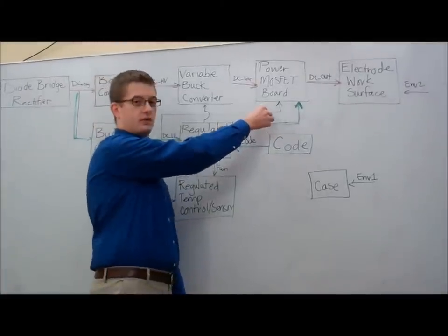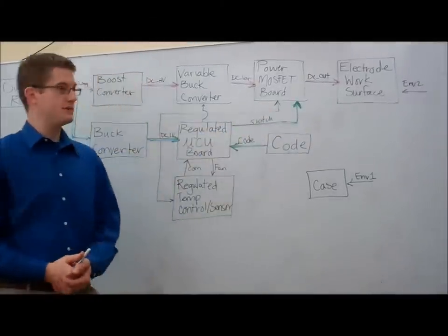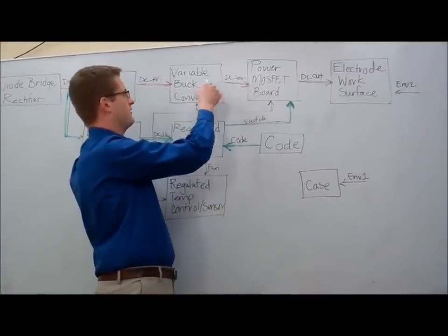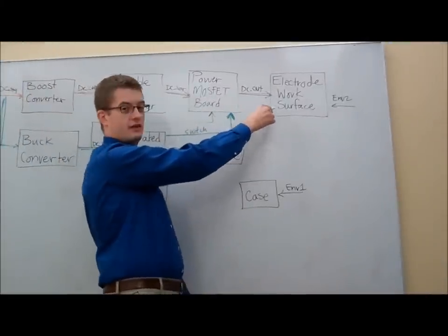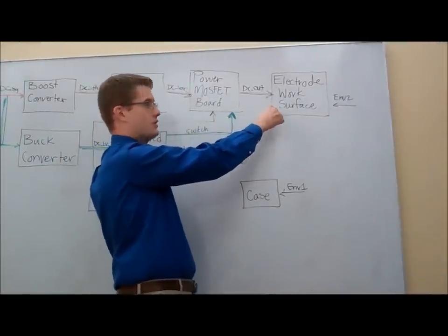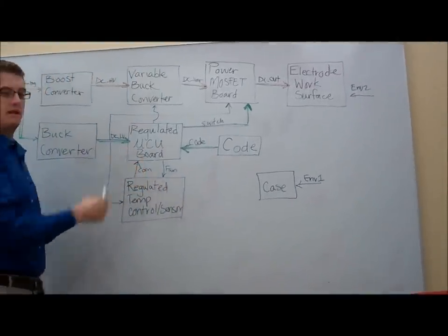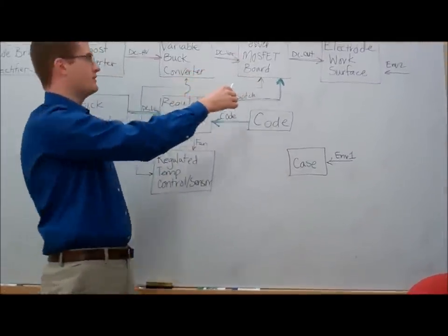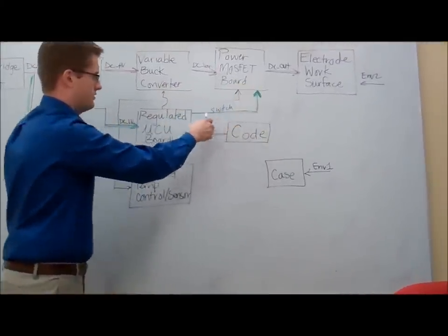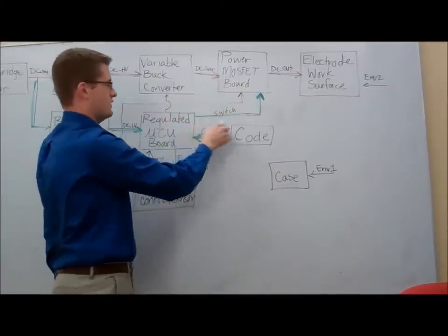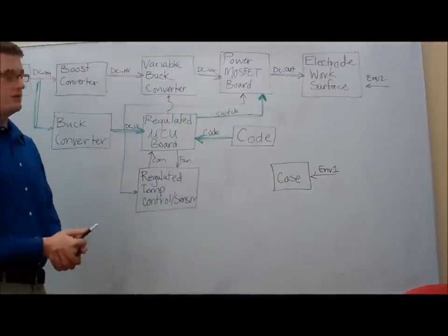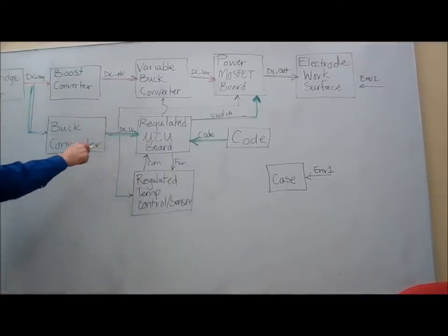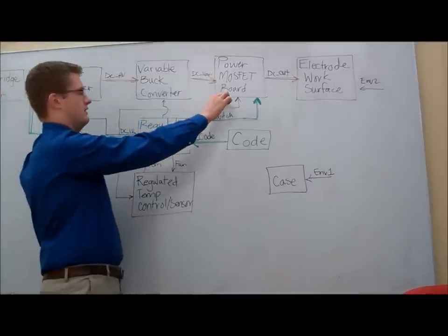This variable DC output is fed into the power MOSFET board. The power MOSFET board is a critical component in our high voltage management system. This board will take a variable voltage DC from the variable buck converter and control which electrode on our work surface will be turned on or turned off. To make this board work we integrate a series of driver chips and high voltage switching FETs. The driver chips turn on and off the signal based on the switching signal coming up from the regulated MCU board. And in order to power the driver FETs we pull voltage through this buck converter to power that.